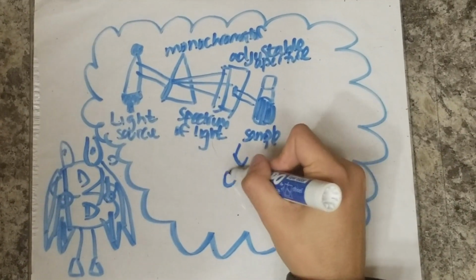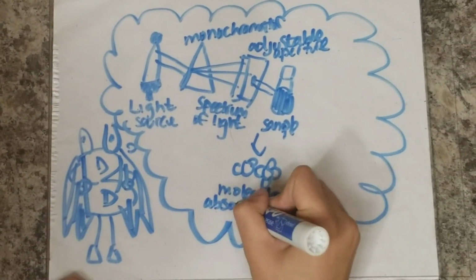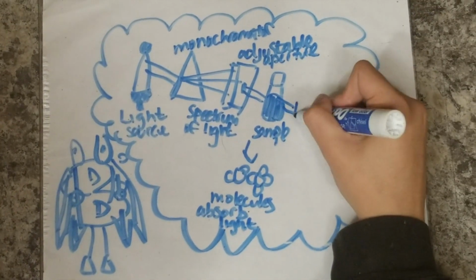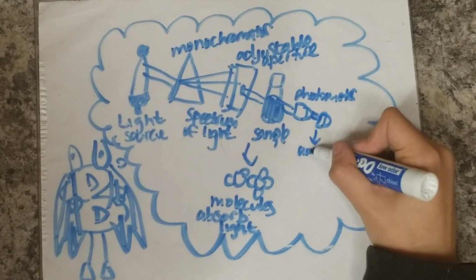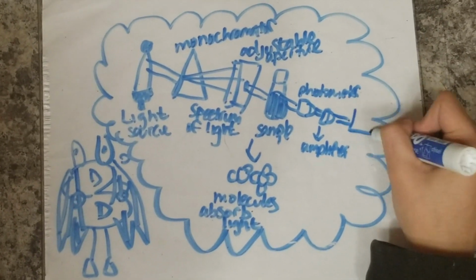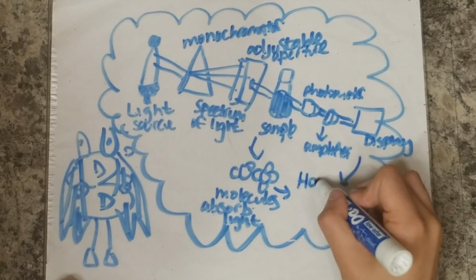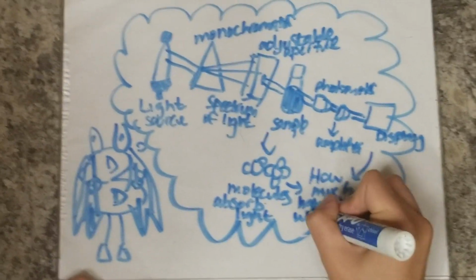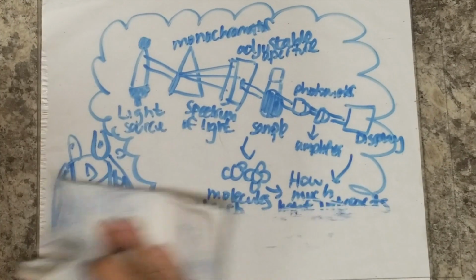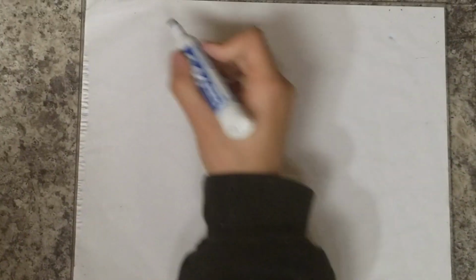Remember how we spoke about Coomassie blue dye that changes color from brown to blue so that we could tell when there is more protein present in our sample? Well, the Coomassie blue dye reacts with amino acids, which make up proteins. The more amino acids there are, the more proteins there are, and the Coomassie blue dye will react with the amino acids. You could then use this to measure the concentration of the protein of interest within the sample with the use of the spectrophotometer. It all makes sense now. Hooray for the Bradford Assay! Time to get to work.